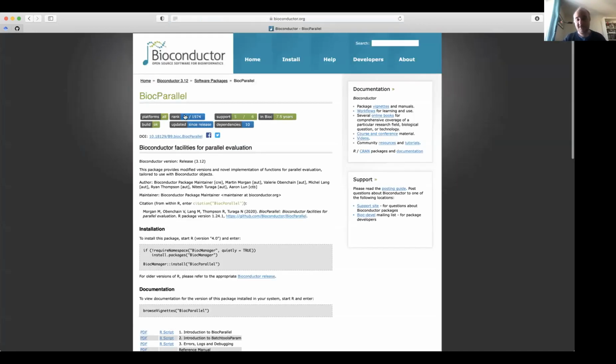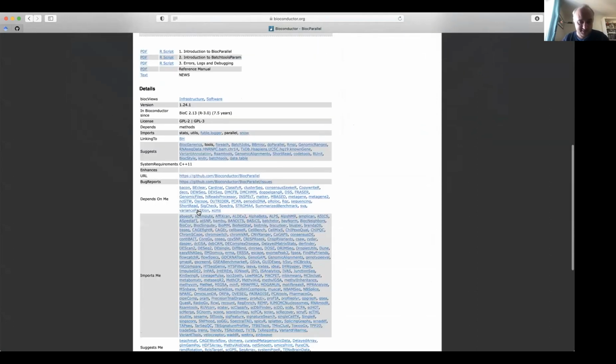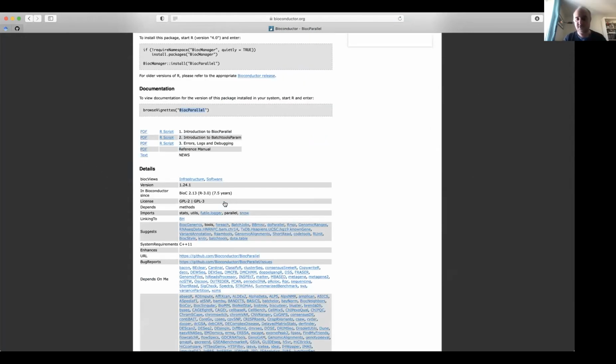You can see it's one of the top ranked packages for Bioconductor. The reason we don't talk about it explicitly, and again, someone in this audience is going to prove me wrong, is that maybe it won't work on Windows. But BiocParallel allows us, does it work on Windows? Yes. So BiocParallel really just allows you to use multiple cores.